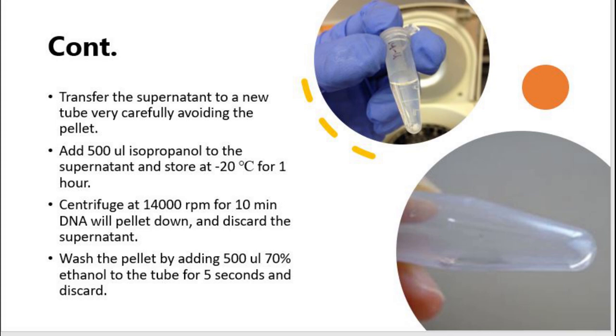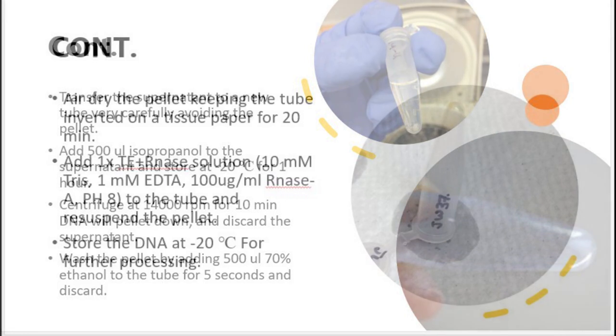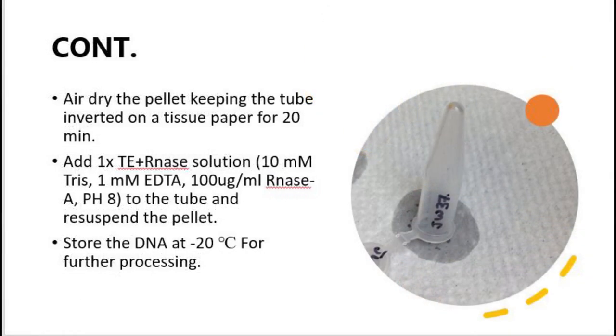Shake it for one to two times very smoothly without disturbing the pellet, and then discard the ethanol. Then air dry the pellet by inverting the tube and keeping it on tissue paper for 20 to 30 minutes.